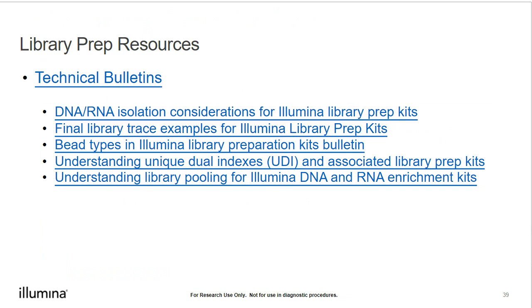We also have technical bulletins on the Illumina support page, and I listed the bulletins that were linked throughout the presentation today, as well as one on DNA and RNA isolation considerations for Illumina library prep kits.